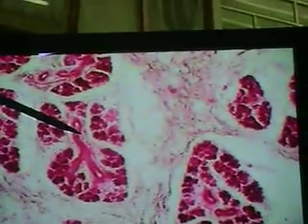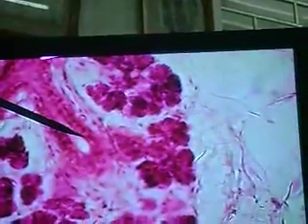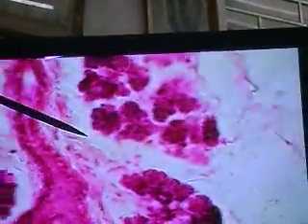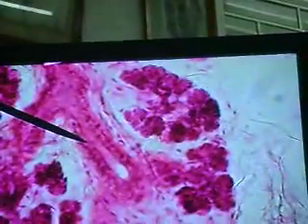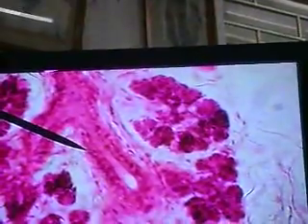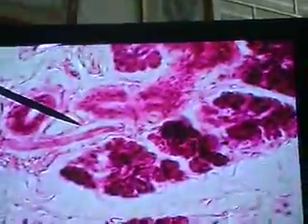Okay, so this is a parotid here. Not like the one before, just towards the edge of the parotid gland. Okay. There's one of your striated ducts coming over right here and leading right into an interlobular duct. So in fact, all of these are interlobular ducts. These big ones here are all within the interlobular connective tissue. The bulk of that are interlobular ducts that you see. Okay?